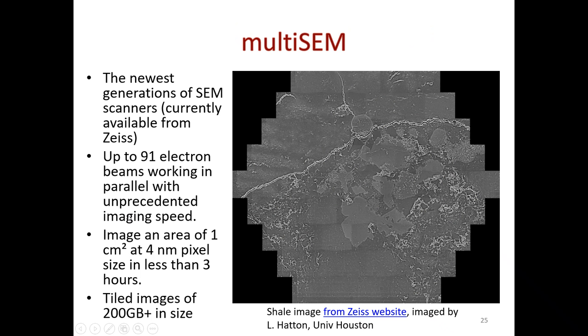These days, this is what I call multi-beam SEM. Some of the latest generation of SEM scanners, to my knowledge, there is one at the University of Houston. So you can have each of these tiles as one SEM image, and there are up to 91 beams working in parallel. So what in a regular SEM is one image, you can have 91 working at the same time and assemble a tiled image.